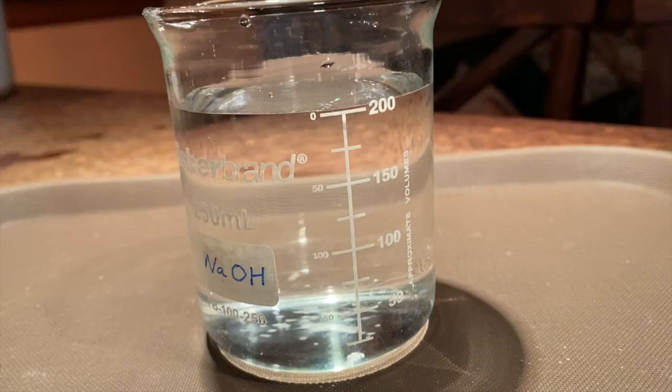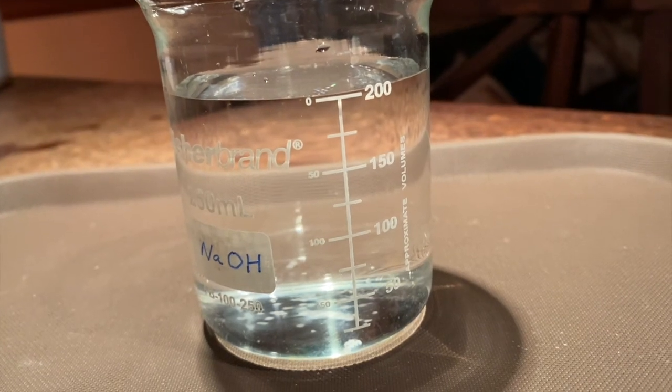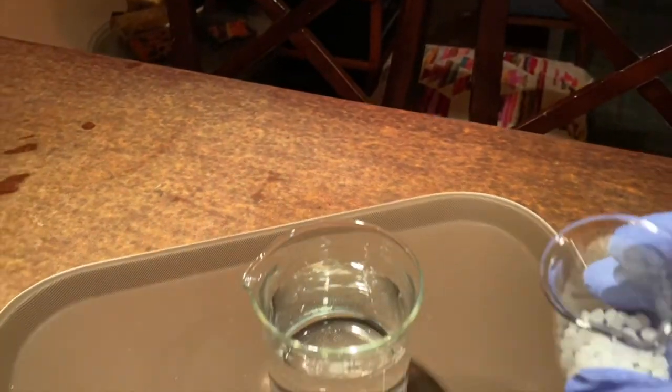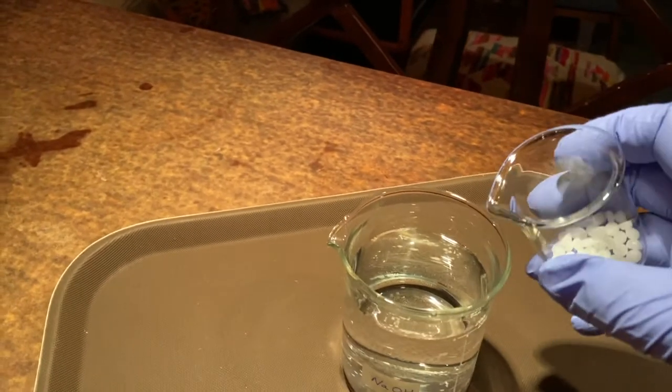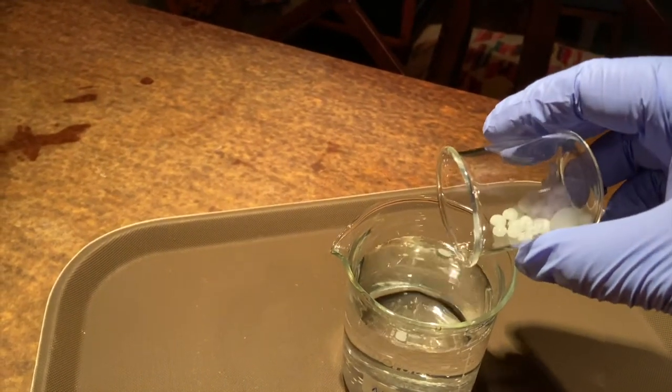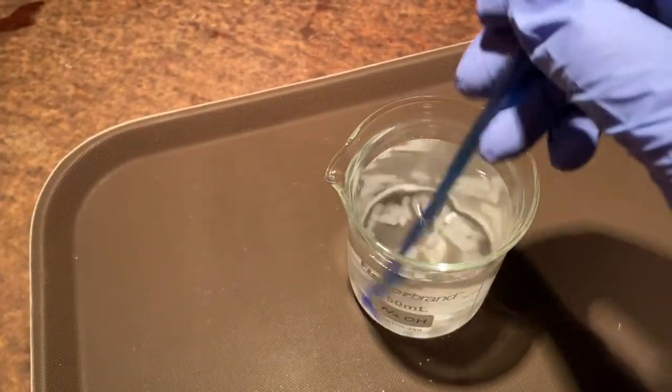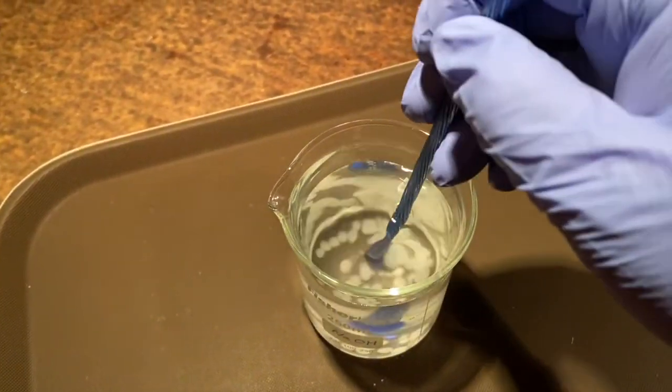Another operational safety issue is how to dissolve the dry alkaline hydroxide in the water. Alkaline hydroxide has a large negative enthalpy of mixing with water, and so you'll generate a lot of heat and potentially send splashes of hot caustic into your face if you add water to the solid. It's best to prepare the water first, which has a large thermal mass, and then add the dry alkaline hydroxide to it, rather than the other way around.